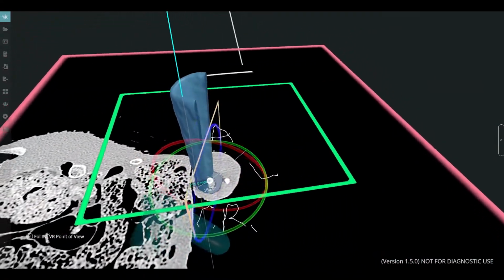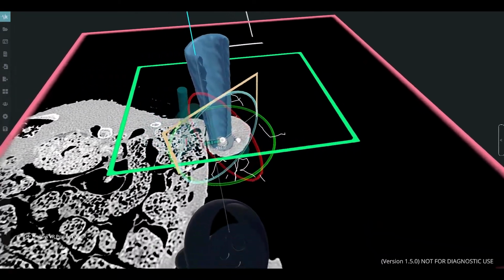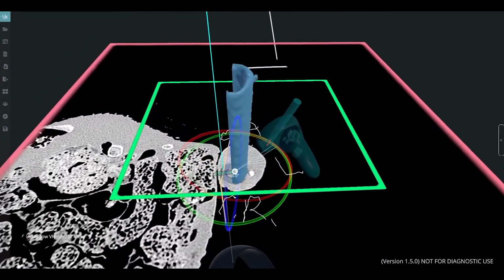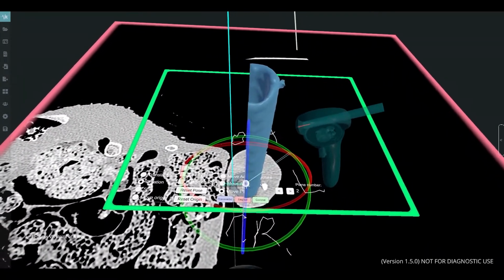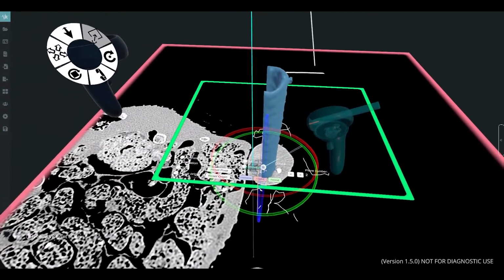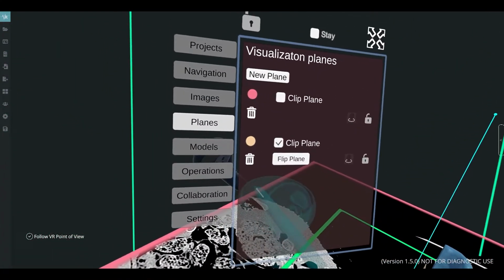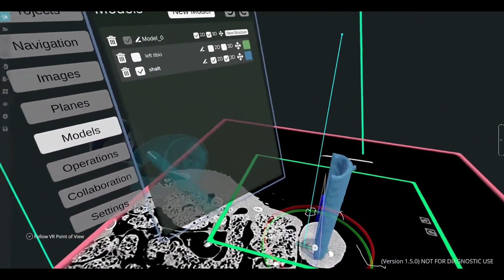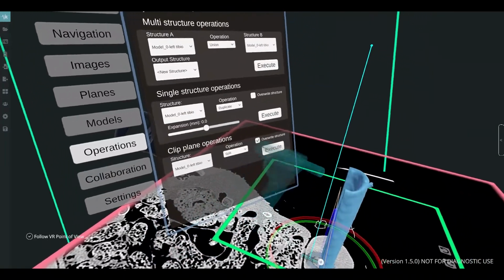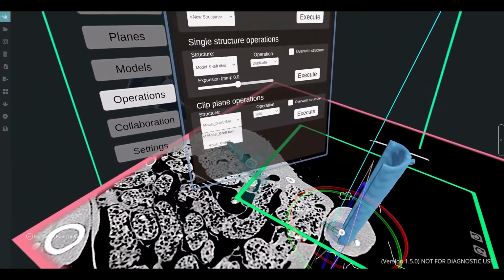Now you see I've got plane 1 and plane 2. I've already selected plane 2, and I'm choosing to move it so that it rotates. But you can translate it, and you can move the center around. And it turns out that the center of the measurement line is where the label is placed telling you the length of that line. So I know where the midshaft is because of that label. So I can put that on the table and then put this clipping plane on it.